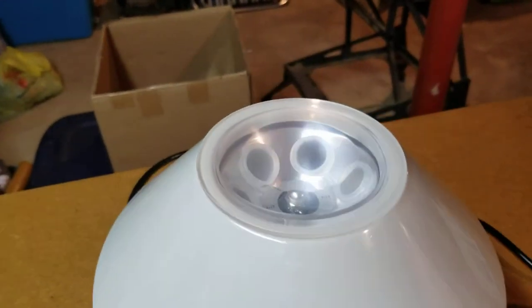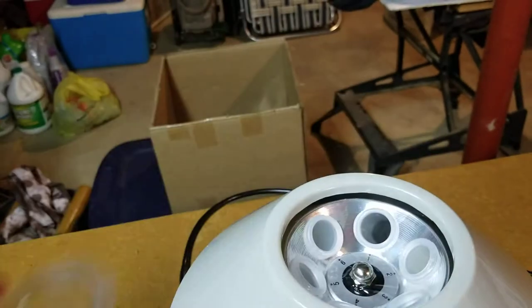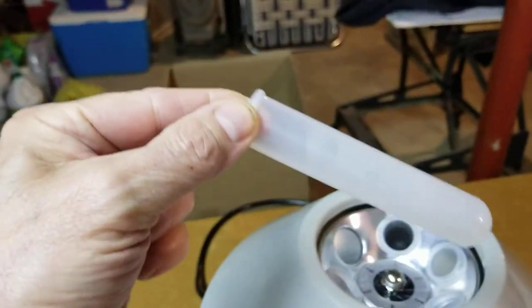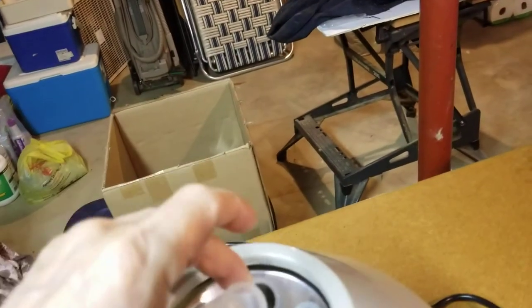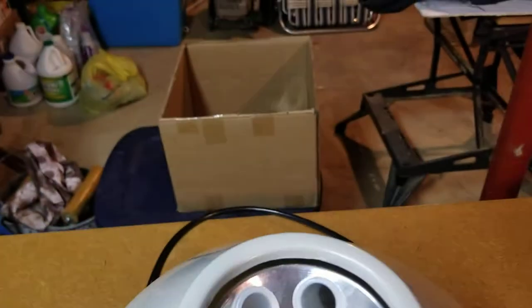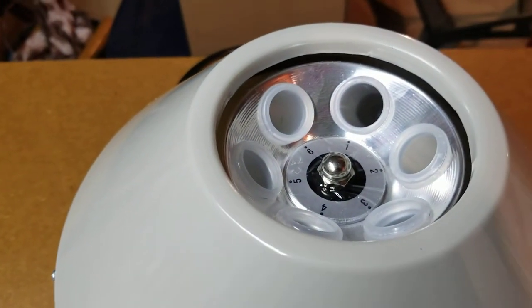At the top there's a lid which comes off, and inside it comes with six 20-milliliter tubes. There's a little bit of plastic wrap on there which I guess is supposed to come off — I just left it there for now.